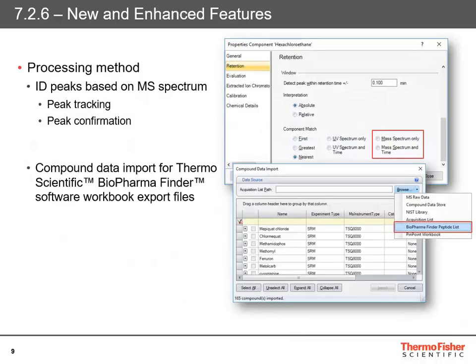You can also import data directly from Thermo Scientific Biopharma Finder. When you've built up your peptide list in Biopharma Finder, you can now import that directly into Chromelion to build up your processing method, complete with all of the transitions and everything you need to make that work straight away.